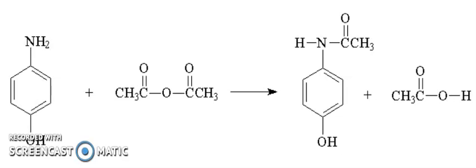Filter your product using a Buchner funnel and the water aspirator or house vacuum line. Wash, rinse the crystals once with a minimum amount of cold water. A few ml should suffice. Allow the crystals to air dry under vacuum. Collect the crude crystalline product and weigh to the nearest tenth of a gram.